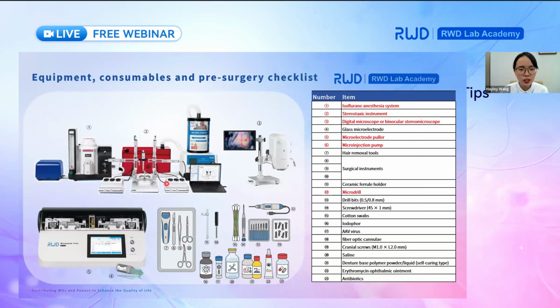So before starting the surgical procedure, we need to prepare the following instruments and consumables. For example, the anesthesia machine, the stereotactic instrument, the micropipette puller, and also the injection pump.